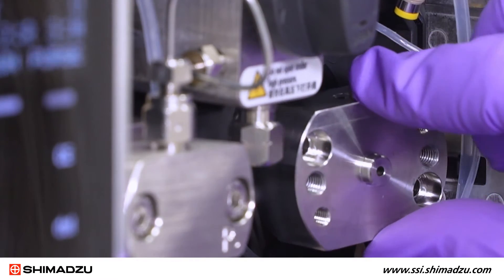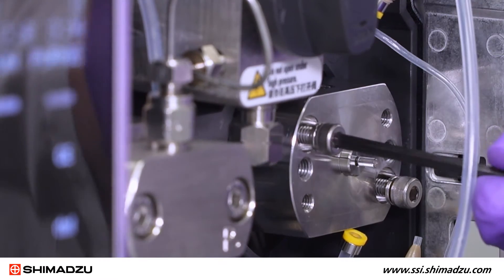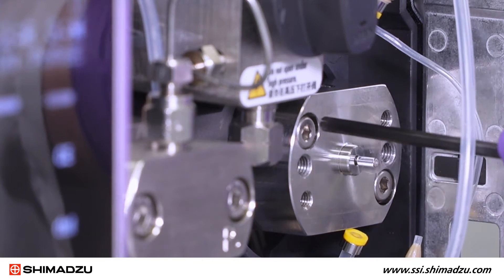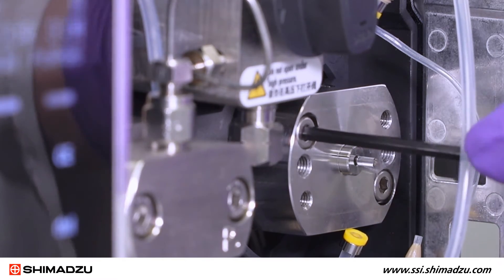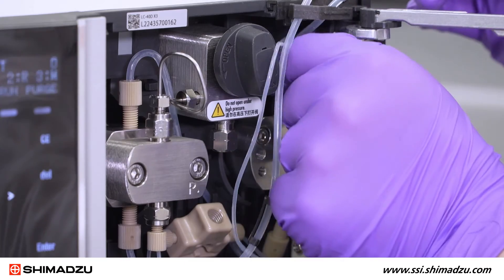Slowly and gently attach the head holder to the pump body. Insert the two hexagonal socket screws and tighten with the M4 Allen wrench, alternating between the left and right screws. Attach the rinse tubes to the top and bottom of the head holder.